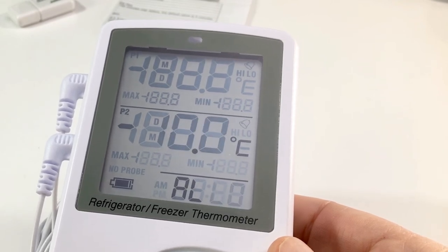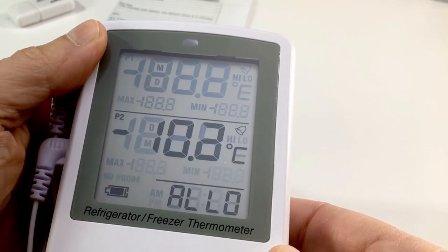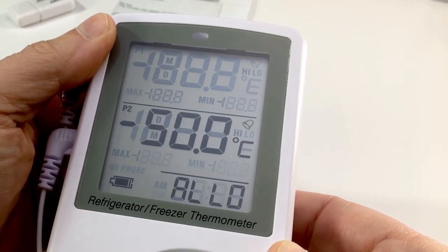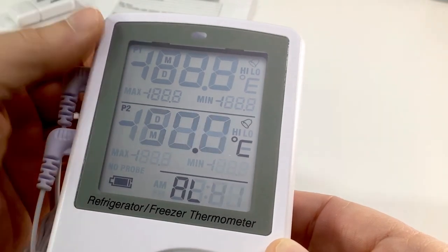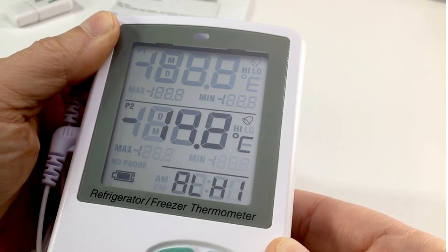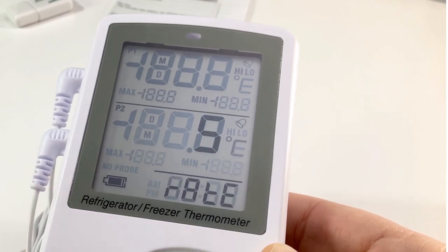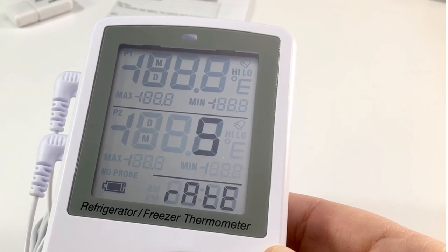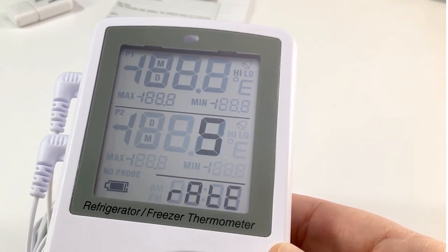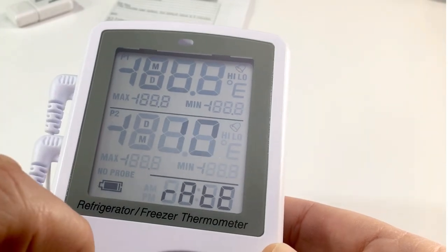Now do the same for P2. For P2 let's say I want to monitor a freezer. The CDC recommends a temperature range of minus 50 to a high of minus 15. Scroll to minus 50 for the low and press Set. Now set the high to minus 15 and press Set. We are now presented with the logging interval. You can log from 1 minute to 720 minutes (12 hours). The CDC recommends a minimum of every 15 minutes, but for better data resolution let's set it to 10 minutes. Scroll to 10 minutes and press Set.